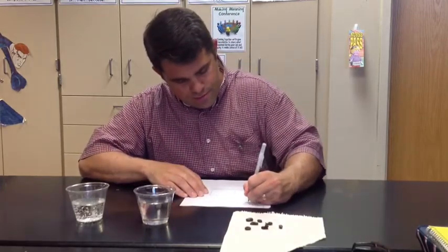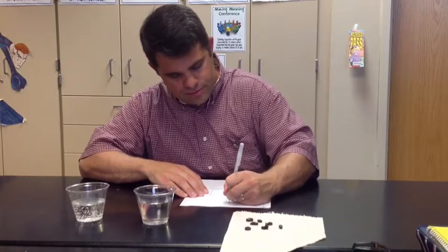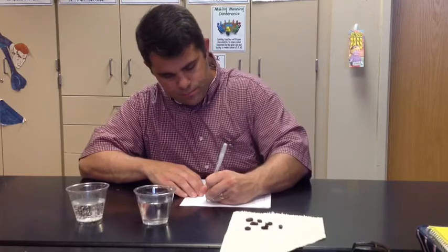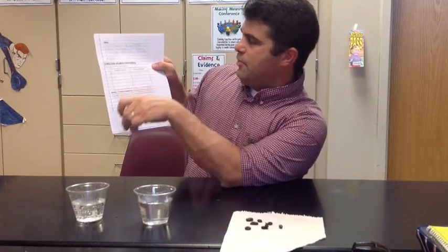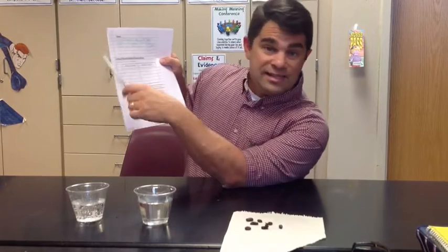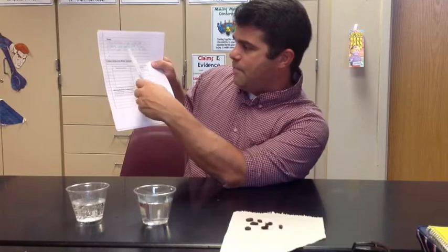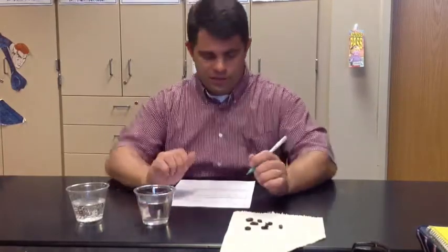Step number three: record your observations in the table. This is your table right here — collect data and make observations. Today it's really easy, there are no numbers or anything like that. Today you have to draw a picture of what you see happening, and when you draw that picture I want it detailed. You will be drawing — I'll show you in a second what I kind of want it to look like.